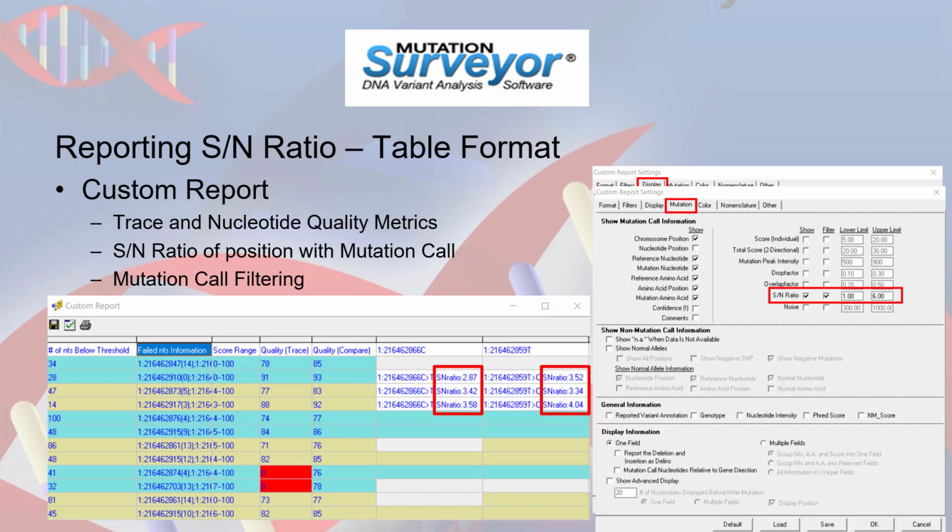The custom report can also output signal-to-noise ratio values pertaining to the mutation calls. The checkboxes for signal-to-noise ratio, located on the top right of the mutation tab, can be used to both display the value for each substitution call and also filter calls based on these values.